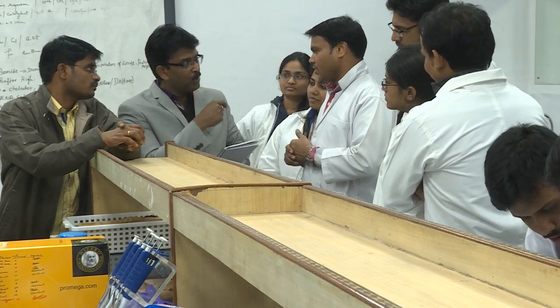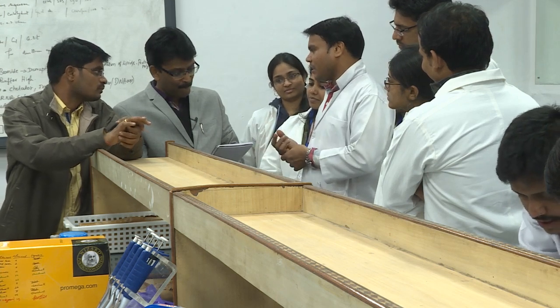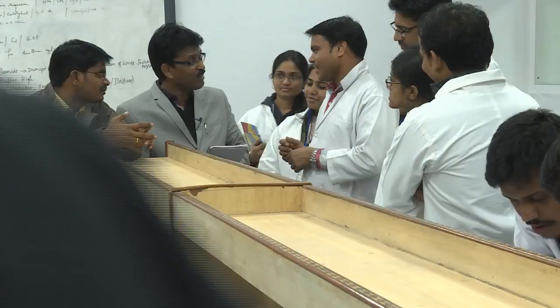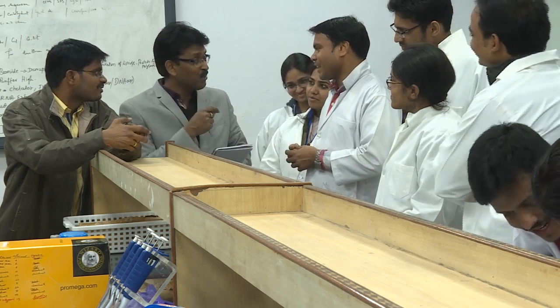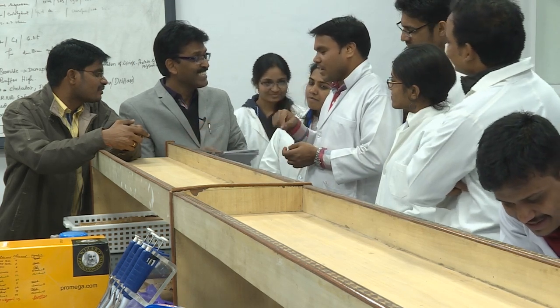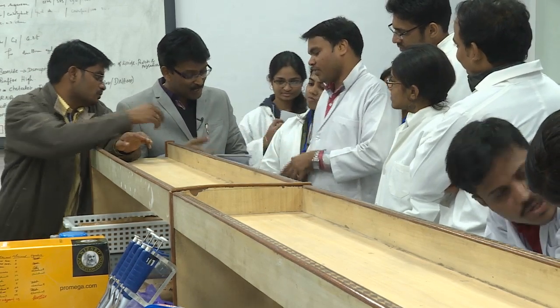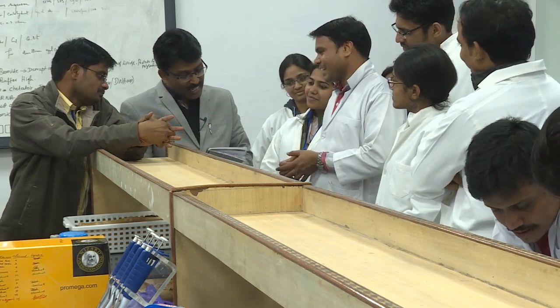Once you spooled out, what was the need for the previous tube? Previous tube, that is what we thought, whether we are getting some difference here or not. For that, that is really creating a lot of confusion now. No, sir, not confusion. Yeah, it is a confusion. When you spooled it out, you should spool out every DNA. Sir, whatever pellet was visible, that is what I am telling. It is not completely spooled out. You have taken a little bit here, and the majority you left it here, and in both the tubes you have DNA now. Okay, all right.